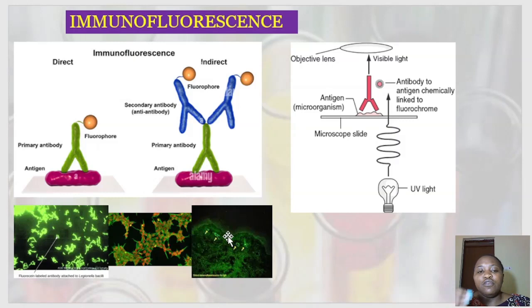When we talked about flow cytometry, we are using immunofluorescence in the situation of cells, one cell at a time, when you are trying to identify particular cells, maybe CD4 cells, other immune cells, or any particle. We can visualize them using immunofluorescence. So you can have it both for tissue and for cells.